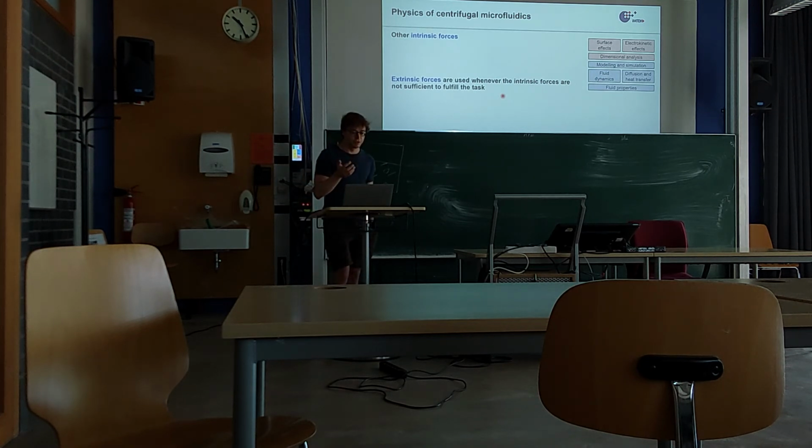So that's it for all the forces that are coming from the centrifugal microfluidics part. And now I want you to think back about what you've learned this semester, because there are other intrinsic forces that are important when working with centrifugal microfluidics, and there are other extrinsic forces that are important.